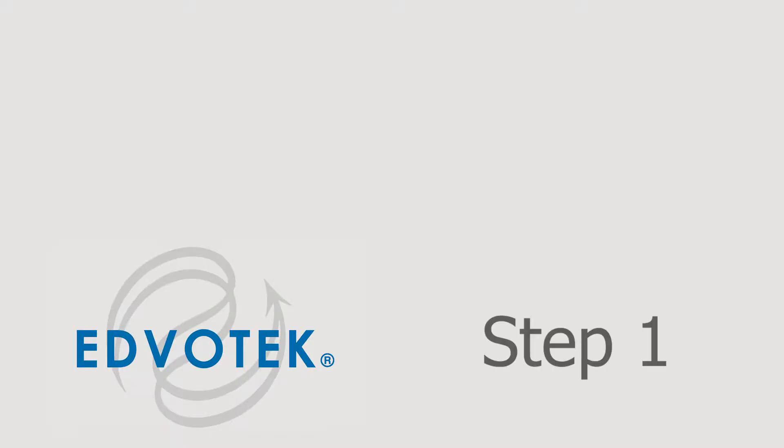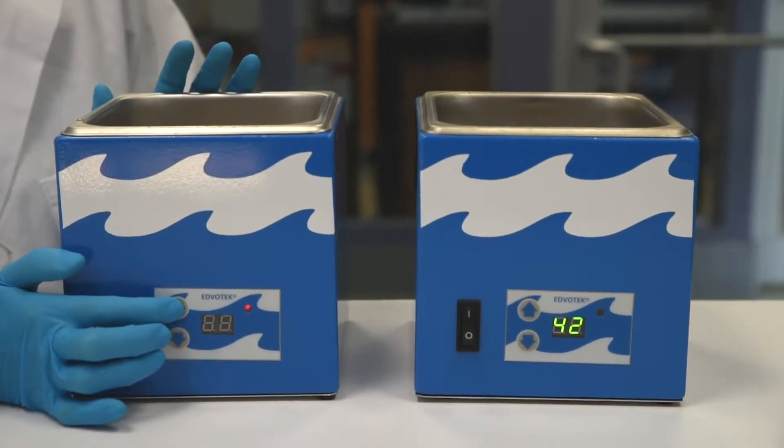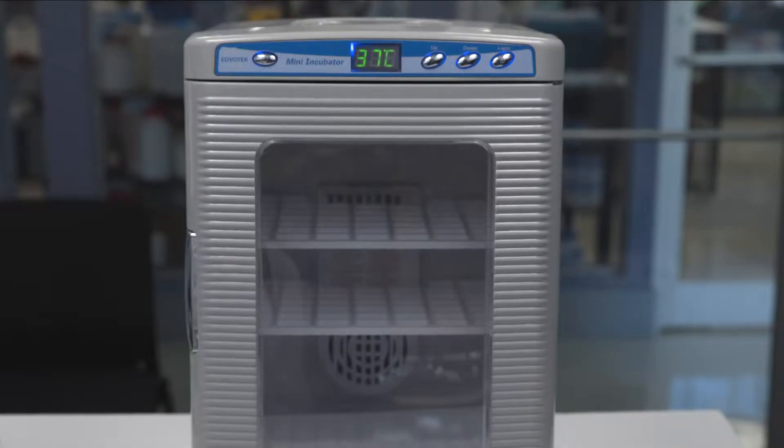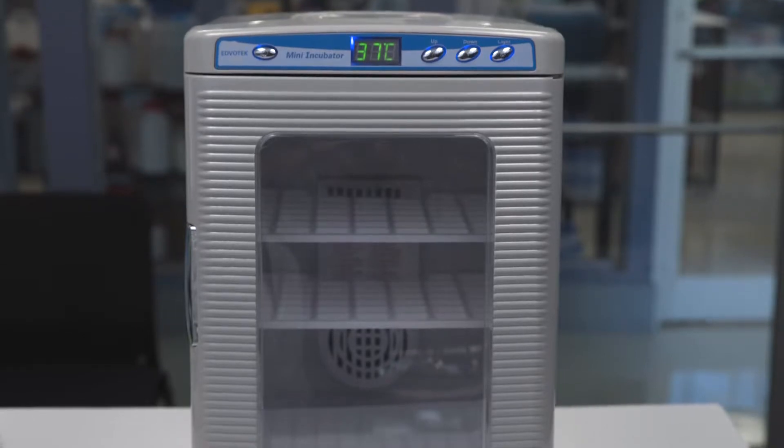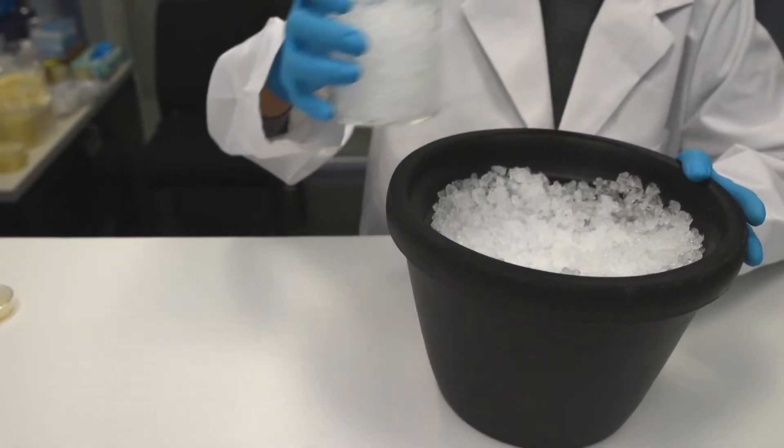Step 1: Equilibrate two water baths, one at 37 degrees Celsius and the other at 42 degrees Celsius. Set the incubation oven at 37 degrees Celsius. Step 2: Prepare ice or ice water baths for each group.